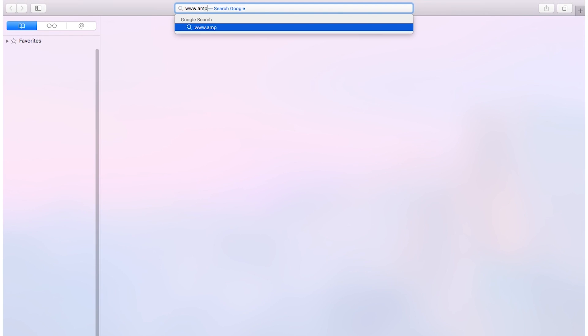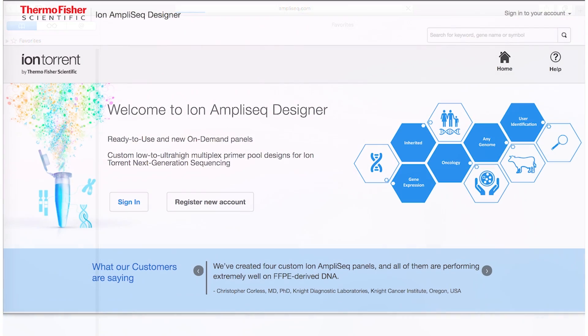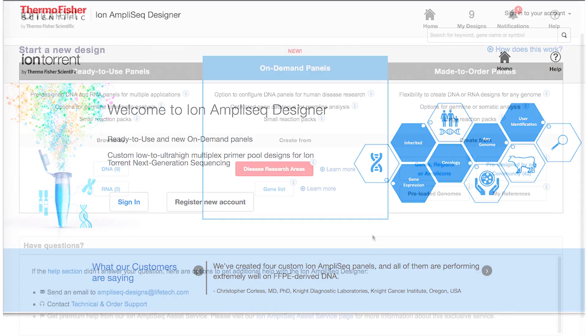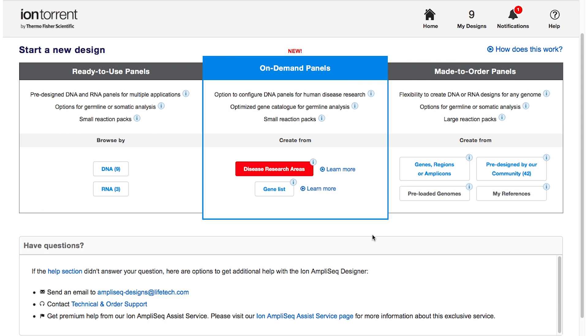So how do you get started? It's pretty easy. Visit www.ampliseq.com, log in, or create an account if you don't have one, and you can now choose your preferred path from here to design your panel.